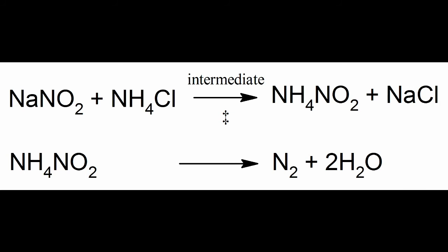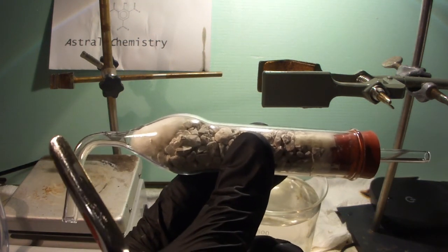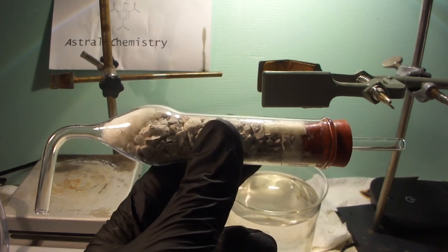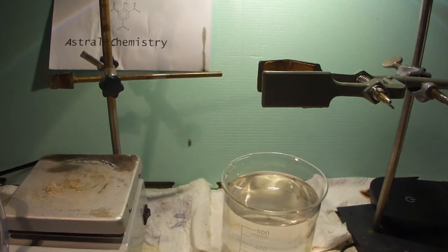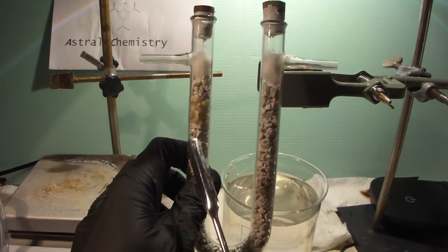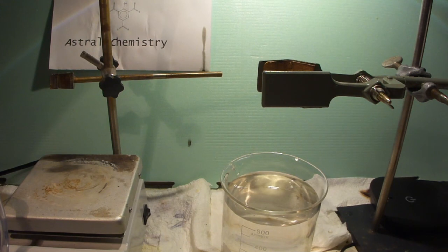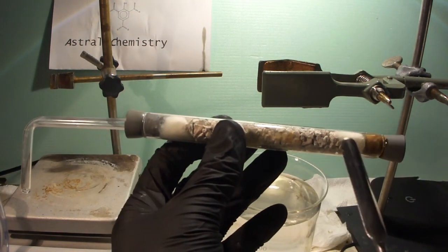Still purer nitrogen can be produced by the decomposition of alkali metal azides. For the home chemist, this method to obtain pure nitrogen gas is way cheaper and safer than to buy a gas cylinder. For example, the nitrogen gas can be used for inert atmosphere distillation. If you want to use the nitrogen as an inert gas, you should first bubble it through water and then dry it by passing it through a drying tube filled with soda lime. The U-tube could also be used. You can even improvise a drying tube from a test tube by cutting open the bottom part. Alternatively, simply bubble the nitrogen through concentrated sulfuric acid.